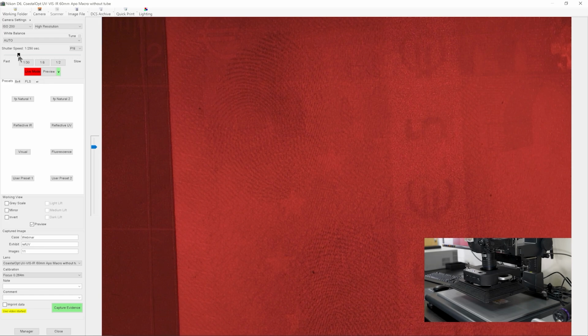Now, the way this is working is actually with those dark fingerprint types like dark powders, black powders, those types of fingerprint treatments will actually absorb infrared light. So this is doing the opposite, where if something absorbs infrared light, it actually makes it darker.